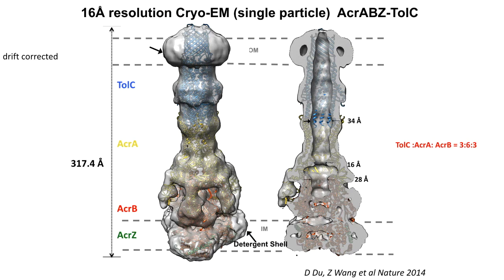But with the CryoEM, even at low resolution, you could sort of solve that problem. But even once we got a higher resolution structure of the overall assembly, this still had some issues with it, right? I mean, this is spanning two membranes. There's an outer membrane, there's an inner membrane, and then you've got this region in the middle, which is hardly empty.